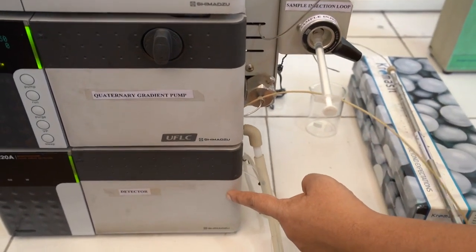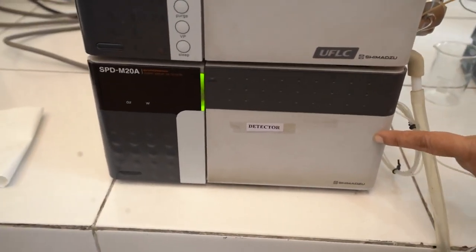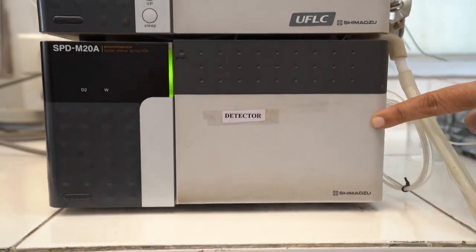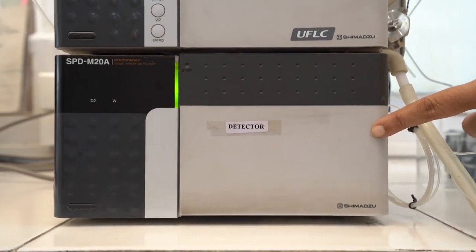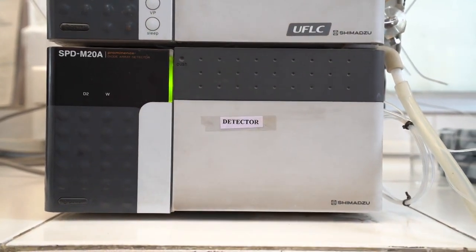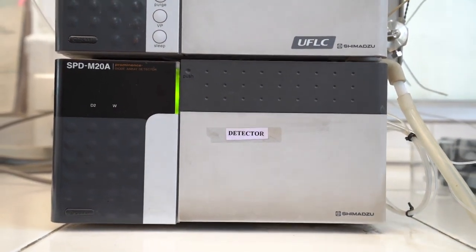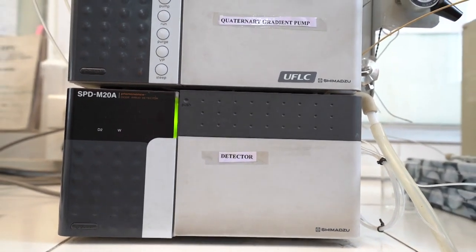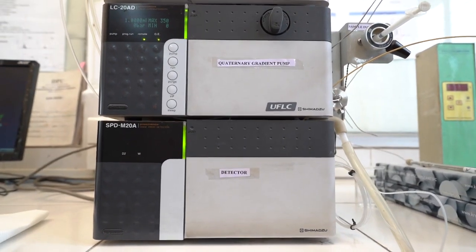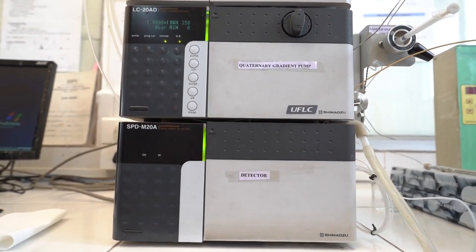What you see over here is a photodiode array detector which is used in HPLC, model number SPD-M20A. This detector has several features. It gives flexibility of operation over a wide wavelength range of 190 to 800 nanometer. It provides excellent signal to noise ratio and high spectrum resolution. It also provides improved baseline stability because of the temperature-controlled flow cell.